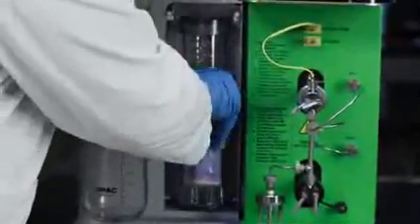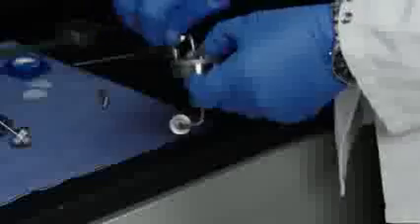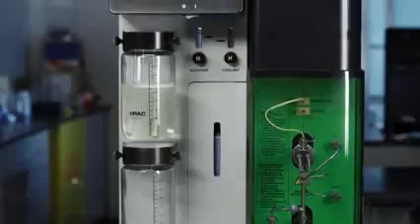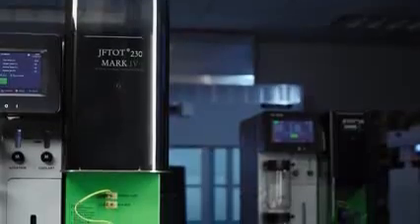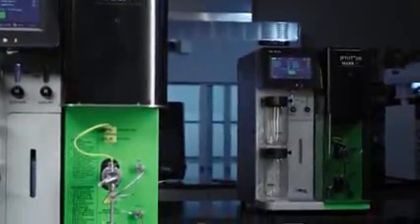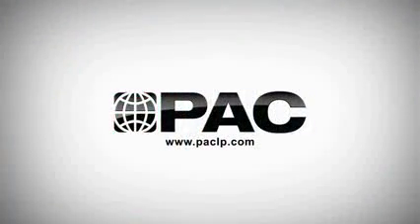Features like the quick connect dryer canister, tool-less fasteners, and automatic line flushing make it easier and safer for you to use. The design was not only based on our 40 years of industry leading experience, but also on input from customers like you. Visit www.paclp.com for the latest information or to contact an expert.